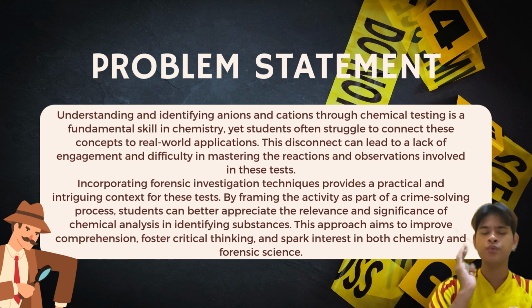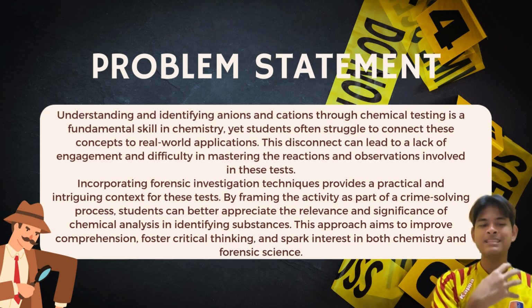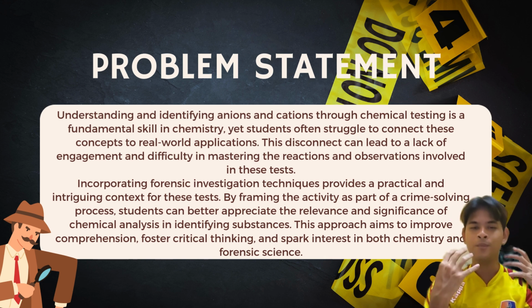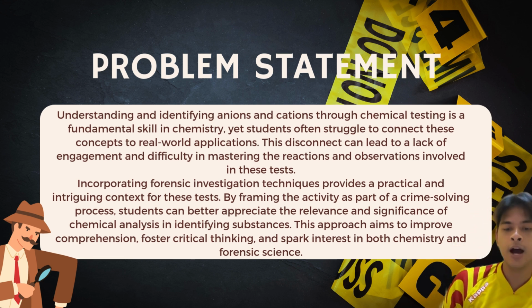So the problem that we encountered in our students nowadays is that they find it hard to understand and memorize the anion and cation chemical tests in answering the questions in SPM.